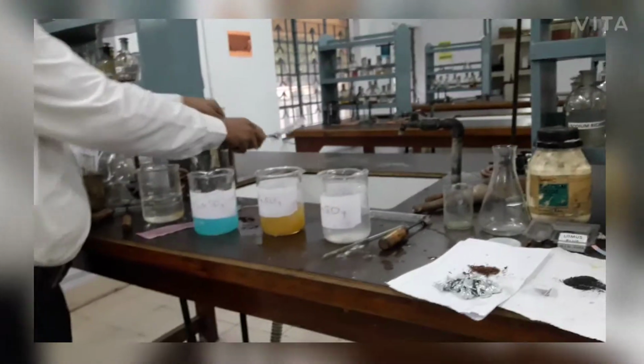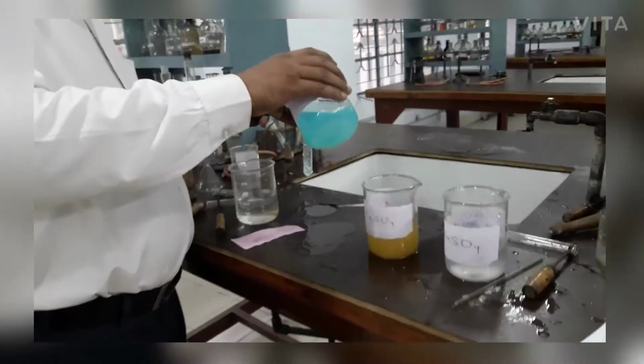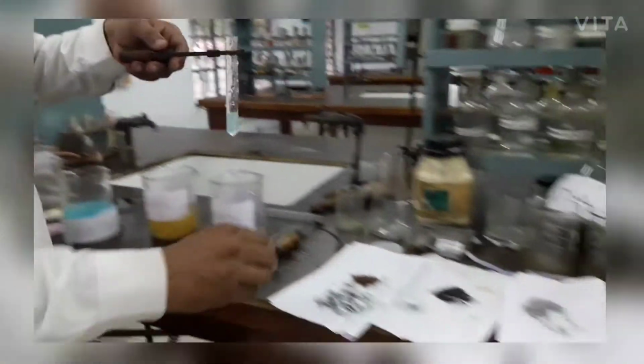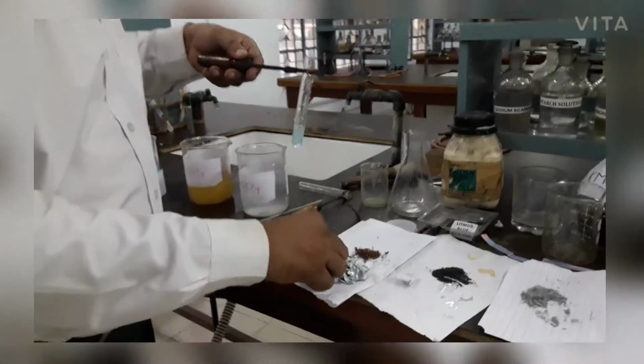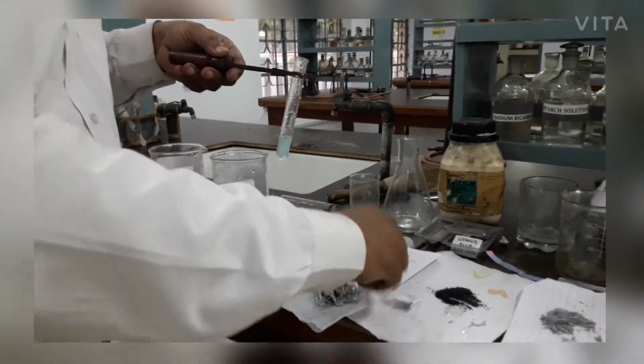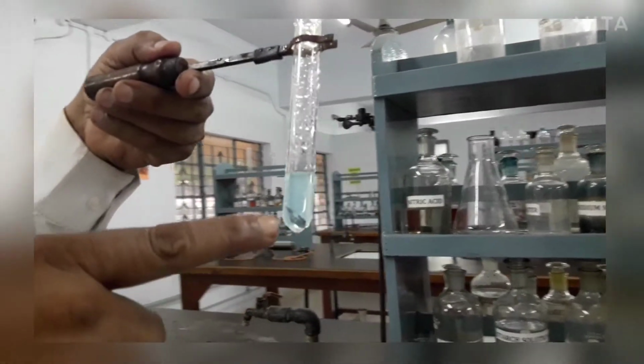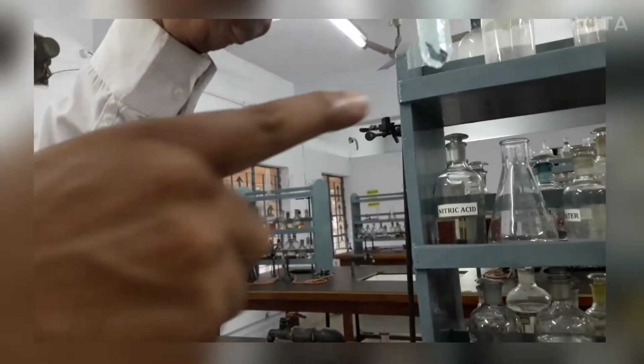Again, we are taking copper sulfate and we add zinc metal in it. A small piece of zinc we are adding and we observe that the reaction starts. Color of zinc changes.